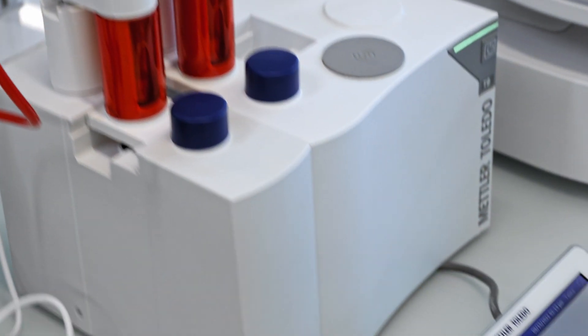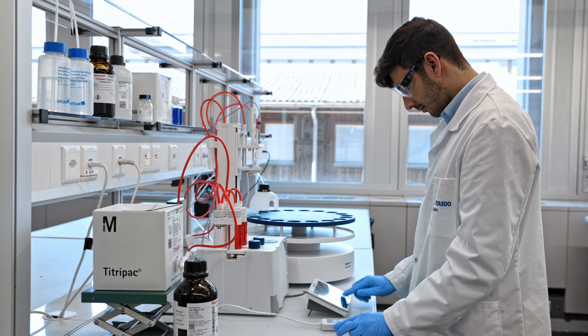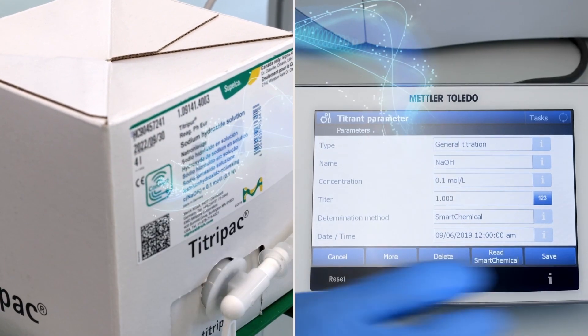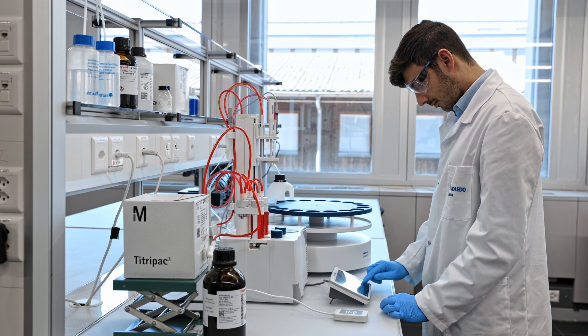After connecting your barrettes, smart chemicals wirelessly transfer all titrant data to the instrument, both eliminating transcription errors and bringing you more quickly to your results.